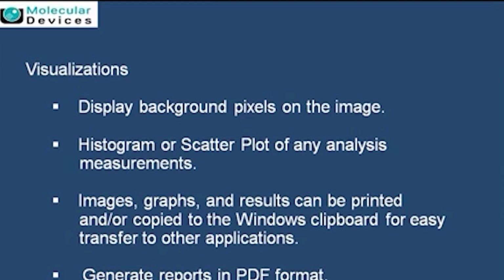And these scatter plots can be plotted against the channel type, say laser 1 versus laser 2 or wavelength 1 versus wavelength 2, in classical terms say Cy3 versus Cy5. So how these two have behaved for me. So again different kinds of graphs, and the images can also be exported to PDF as well as being visualized in GenePix Pro for your further screening for different QC applications.